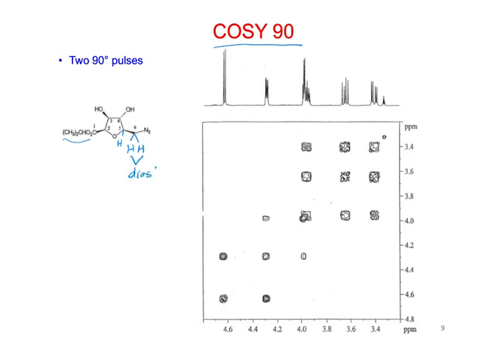Yeah. Meaning they have different chemical shifts, so they will couple with each other. That would split it into a doublet, and then what else? And be split again from H5, right? So each of these should be a doublet of doublets.